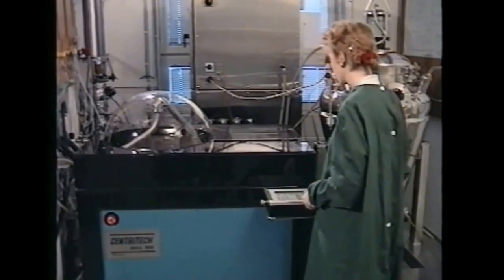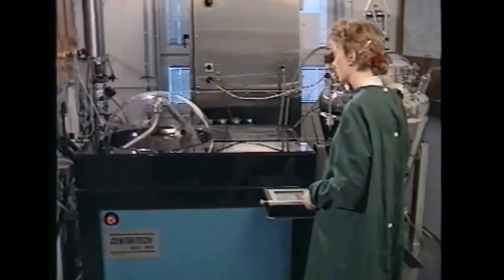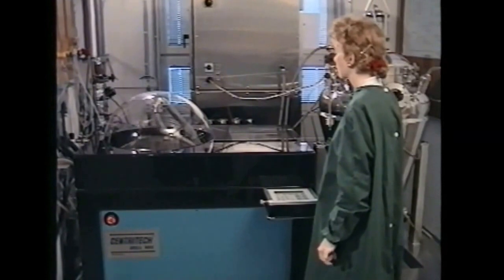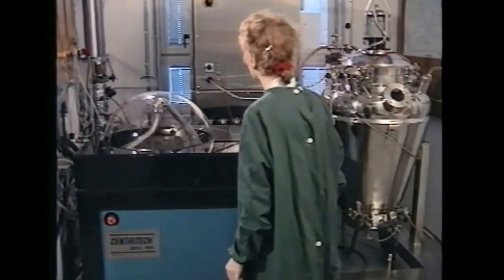A large range of operations can be performed using this panel from completely automatic pre-programmed operation to totally manual control.